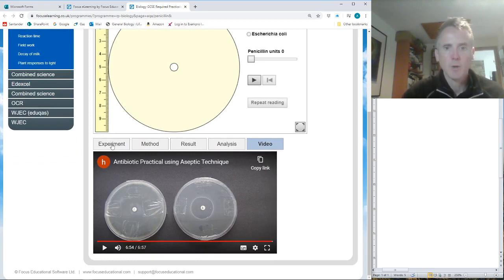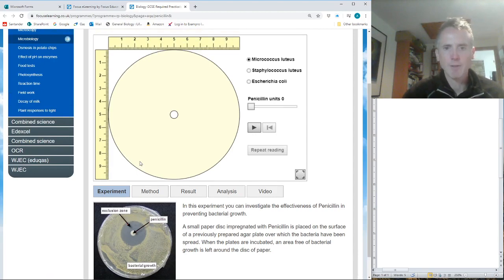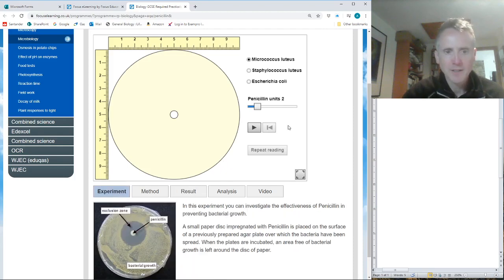Once you've watched that video, I want you to collect the data. On the results table that I gave you, you're going to go between 2 and 10 units of penicillin. I can change that here. I want to start with 2 units, and then you're going to go to 4 and 6 and 8 and 10. Don't use theirs, please. They've gone 0, 1, 2, 3, 4, 5, 6, 7, 8, 9, 10. It'll take you forever. So we're just going to do 2, 4, 6, 8, 10, just to prevent you going mad, hopefully.